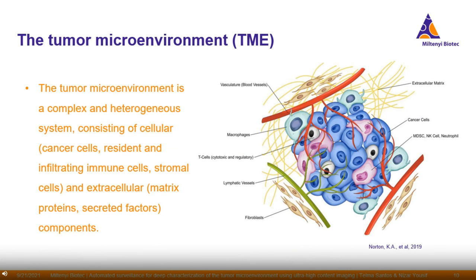Thank you very much, Telma, and hello everyone from my side. Now I will give you a brief introduction about the tumor microenvironment, and then I will present some data from different types of cancer generated by the MACSima. So what does the tumor microenvironment mean?